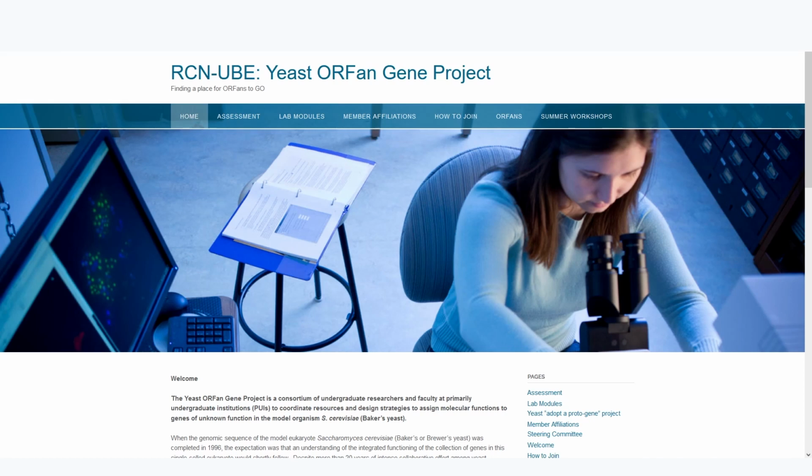I helped create this module, and in this video we will walk through how to use a genome browser to view different genomic data and to learn more about protogenes. I'll be walking through the module and answering the associated questions using the protogene ORF 14869.